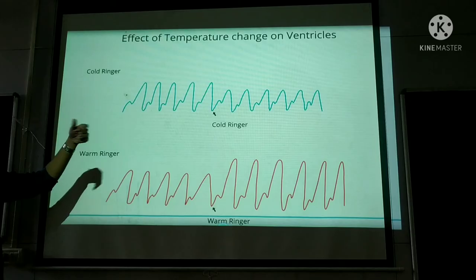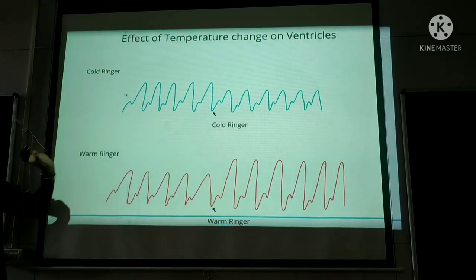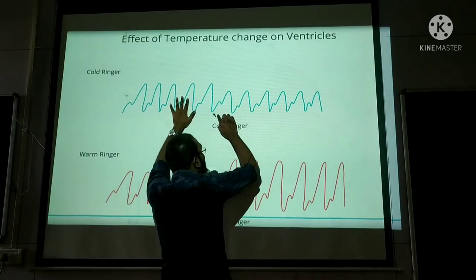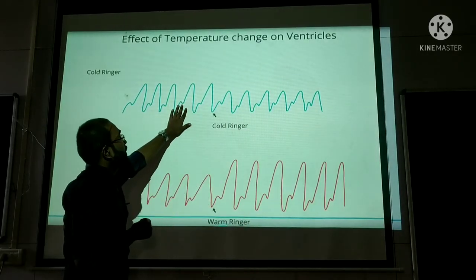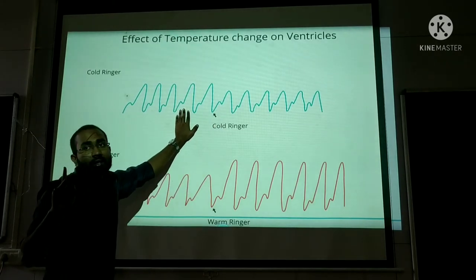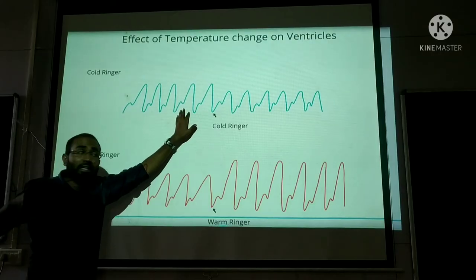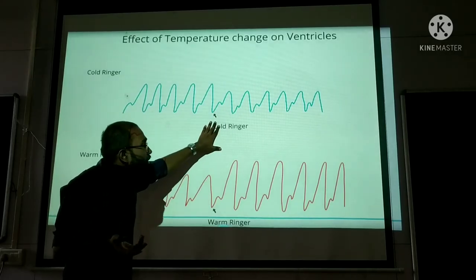Now, effect of temperature change on ventricles. When you change the temperature in the ventricles: cold ringer solution — compared to normal — the height of contraction has decreased. Heart rate doesn't show any difference, but height of contraction has only decreased. Please note: heart rate has no difference here. Sinus venosus was the pacemaker — that's where conduction increases or decreases. Here in the ventricles, there is no pacemaker, only ventricular muscles. So heart rate has no difference.